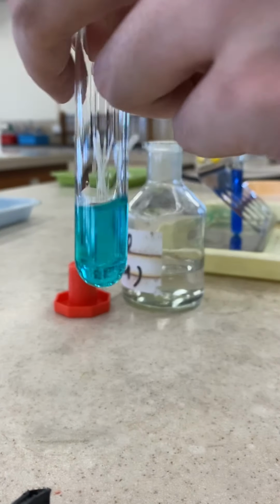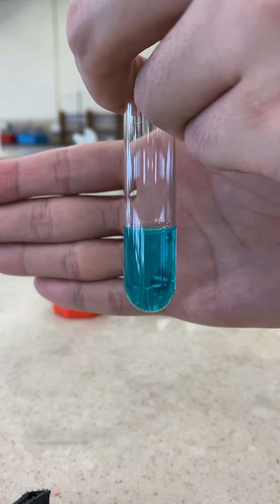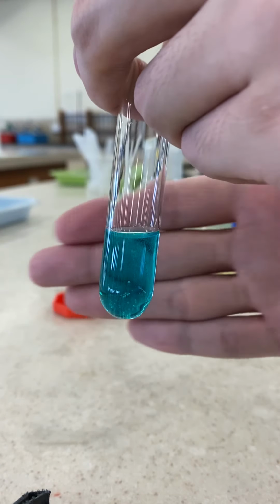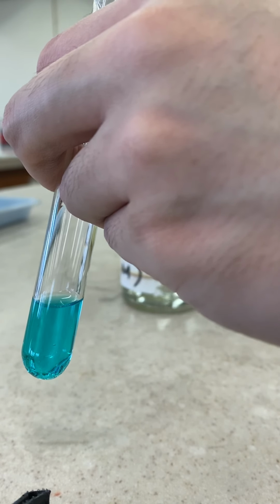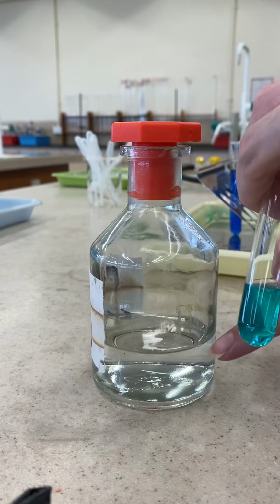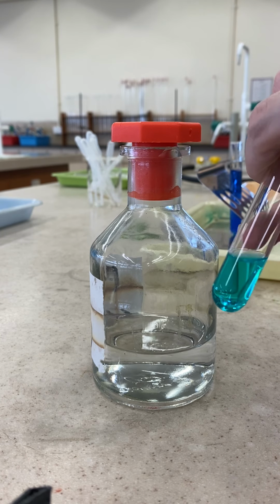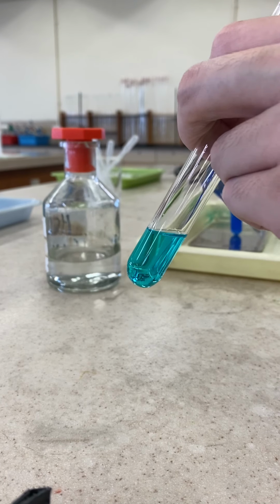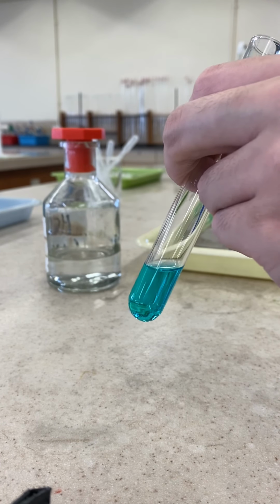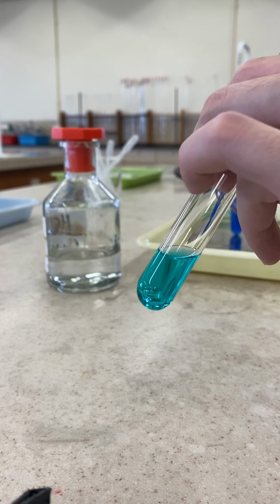And finally, what can you see? A blue solution is formed, a clear blue solution. So how can you describe this observation? The solution color, originally for the acid, is colorless, and then finally it turned pale blue in color, and during the reaction some gas bubbles formed. So in this process, do you think that a new substance is formed?